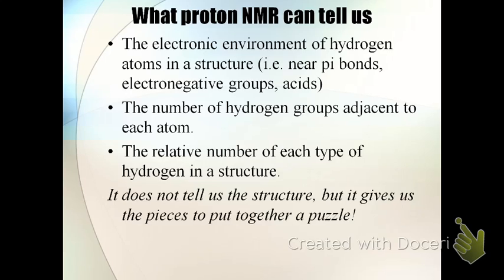So if, for example, I have one neighbor and my neighbor has two neighbors, you can kind of piece together that my neighbor is between two people on the street. And that's kind of the idea with how we use this information. It's kind of to develop a sequence to know which neighbors are next to each other. When neighbors talk to each other, they talk to each other different amounts, and because of that, we can use that information to piece together a simple structure for many compounds, just using NMR spectroscopy.